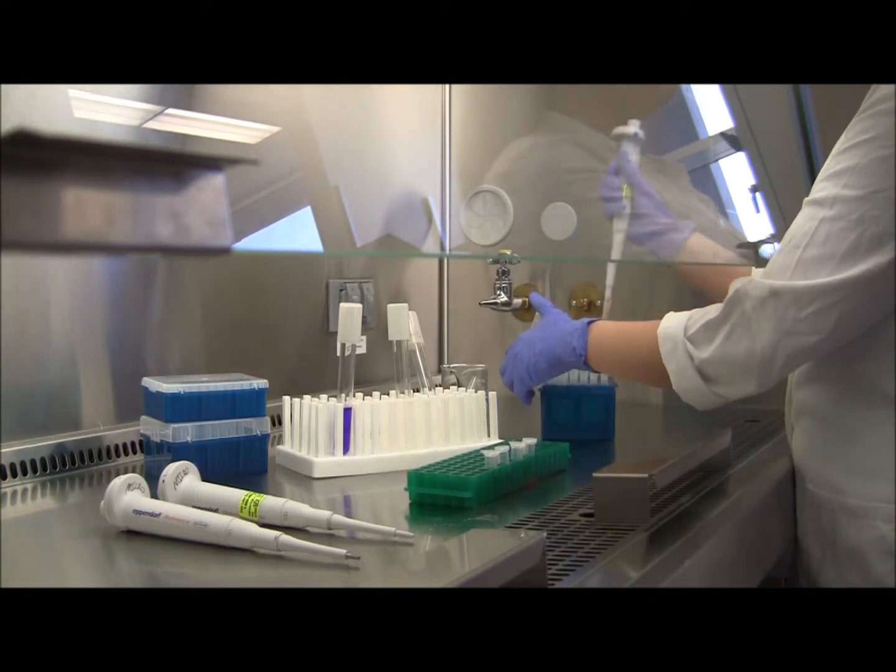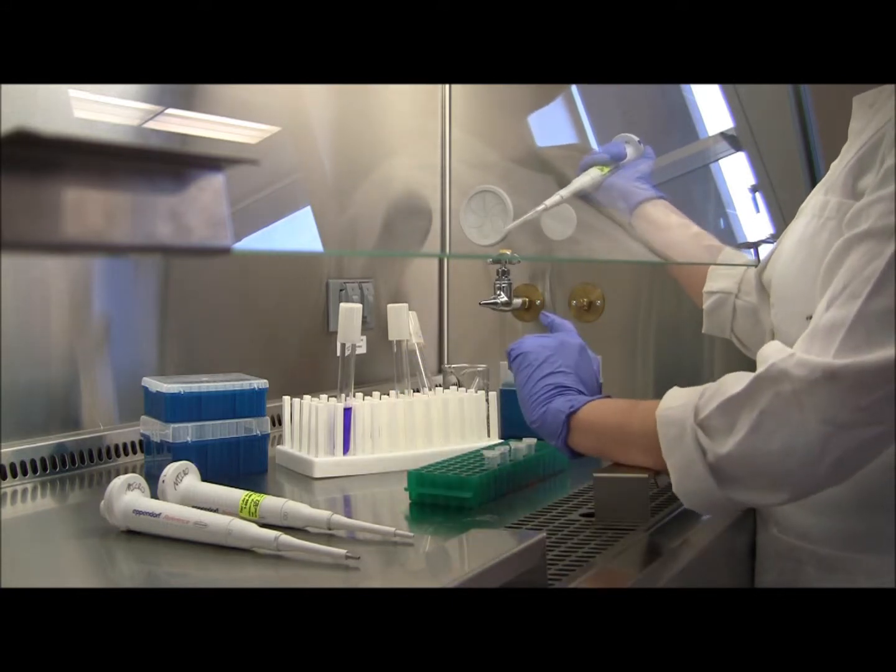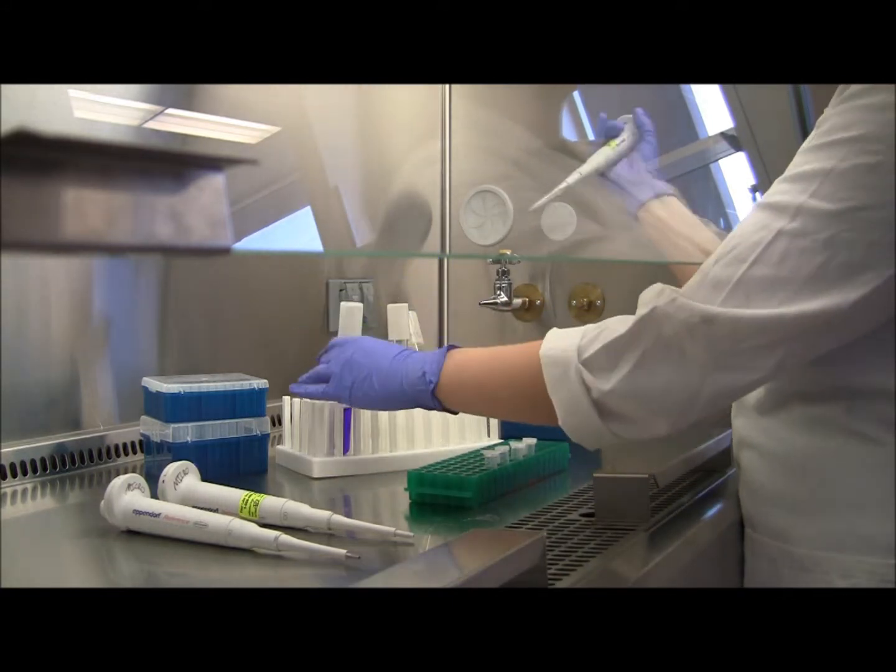Now we're ready to put a tip onto the pipetter. You want to firmly place the tip onto the pipetter, but not hard enough that you'll actually break the pipetter.